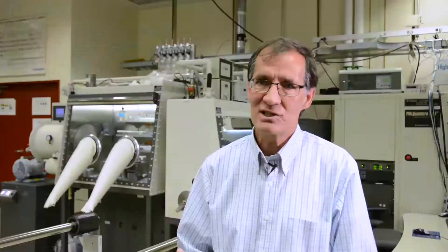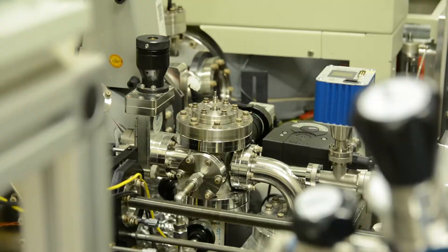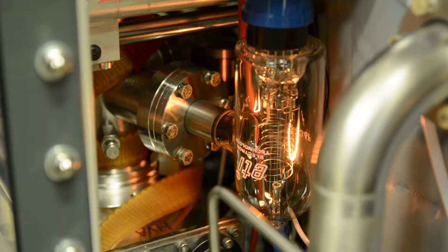What's unique about this instrument, we've customized this commercial XPS instrument to allow for samples to be treated and processed in anoxic environments and transfer it directly into the spectrometer for characterization.